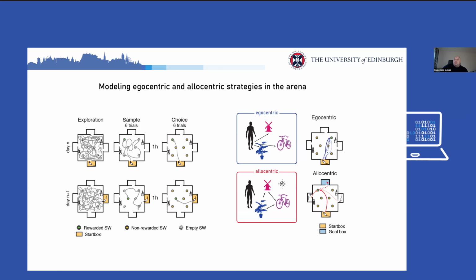After 1 hour to 90 minutes, we test whether animals have learned which one is the rewarded sandwell. And if they are correct, they would essentially visit the rewarded sandwell first. And session over session, we change the position of the rewarded well by randomly selecting one of the 6, and that goes on for several days. On this overall structure, we are able to have animals use either egocentric or allocentric strategies by modulating how they solve the task and which starting points we're using for each session.